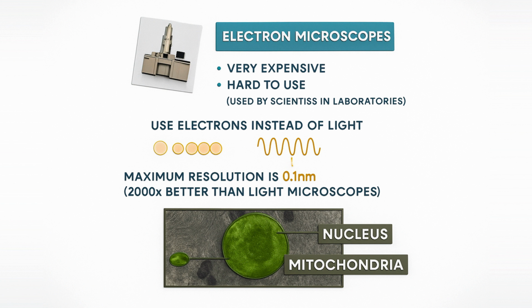To summarize, the most important thing to understand and remember is the comparison between the two types of microscopes. Light microscopes are more accessible, portable, cost-effective, and easy to use, but they have limited resolution and are not suitable for observing detailed internal structures within cells. Electron microscopes, while large, costly, and complex to operate, offer extremely high resolution and magnification, allowing us to explore the fine architecture of cells and molecules.